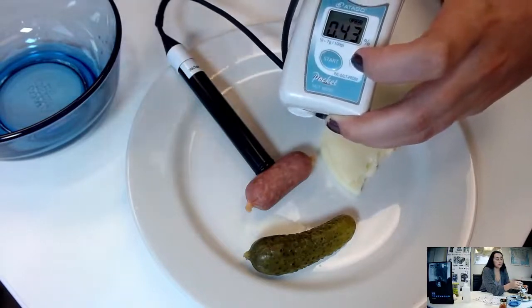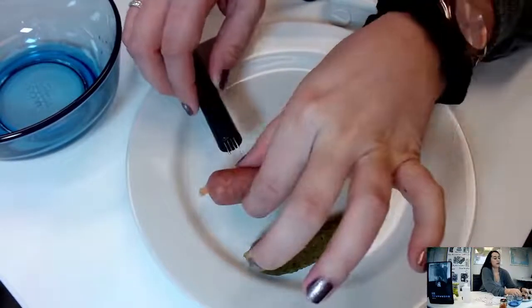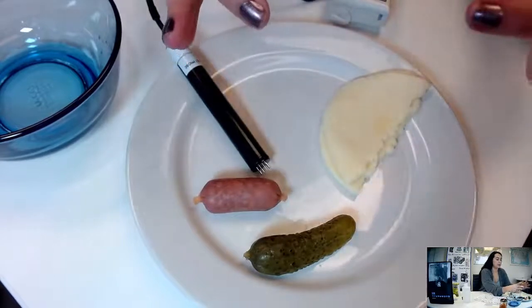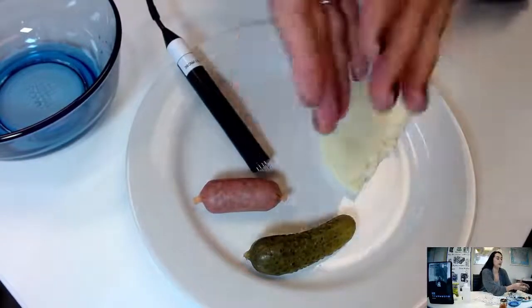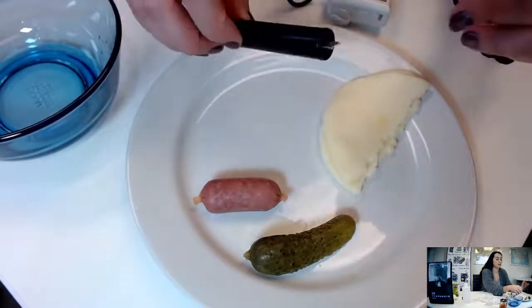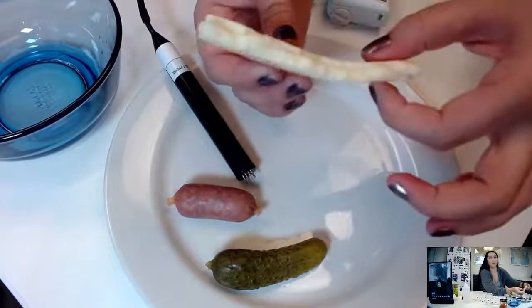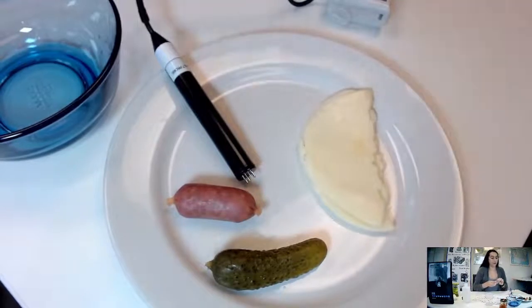All right, so now that we've done those two, we'll move on to the cheese. One other thing to mention is when you have a sample like cheese, it's typically very thin or sliced. There are blocks as well, but if you have the thinly sliced cheese, we do recommend taking the sample and folding it a couple times to get a thicker sample so that the probe can be inserted completely into the sample. As you can see here, this is one or two pieces of cheese, but it is folded over like that to get the thicker sample for the probe.